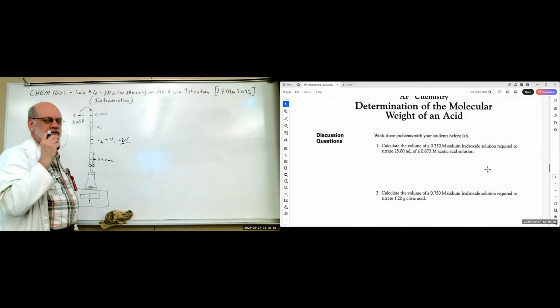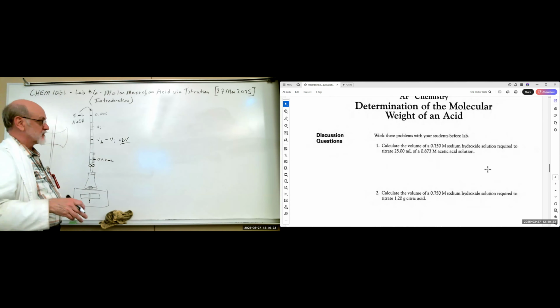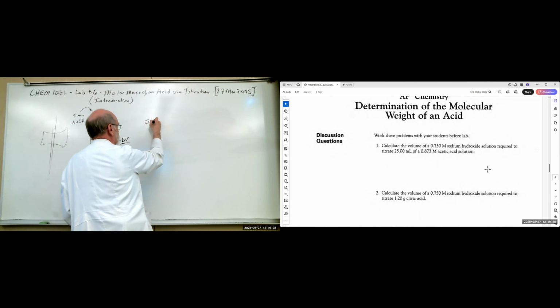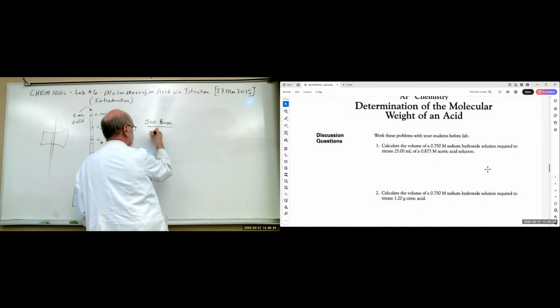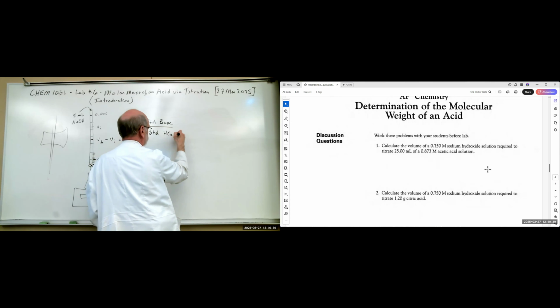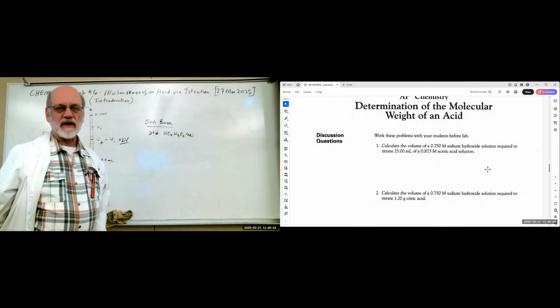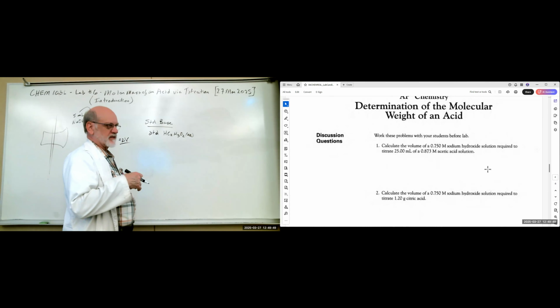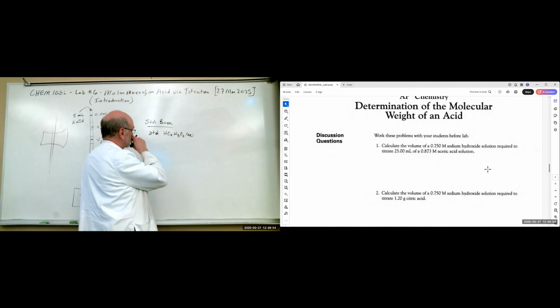So we're going to do 3 titrations to standardize the base. So the base is going to go in here, and down here for standardizing the base, sodium hydroxide, we're going to have a standard acetic acid solution. And I don't remember what it is right now. I think the method says it's 0.873. But I think the last time I standardized it, it was a little different. So you'll have the real number when you get to the lab.